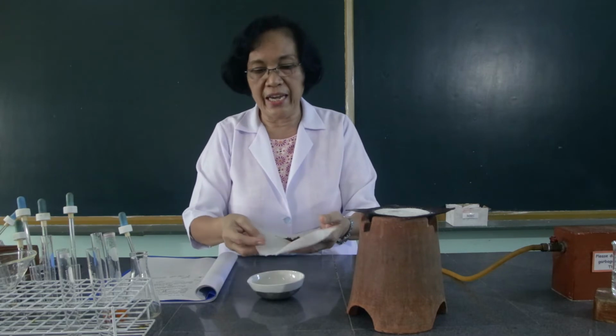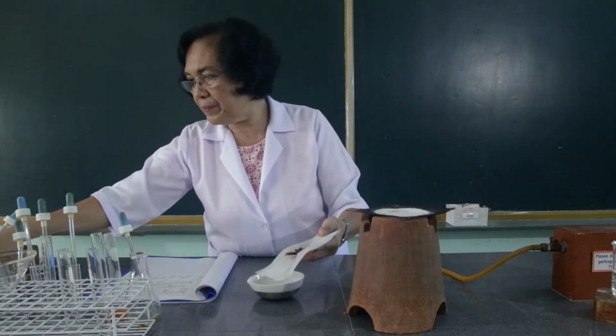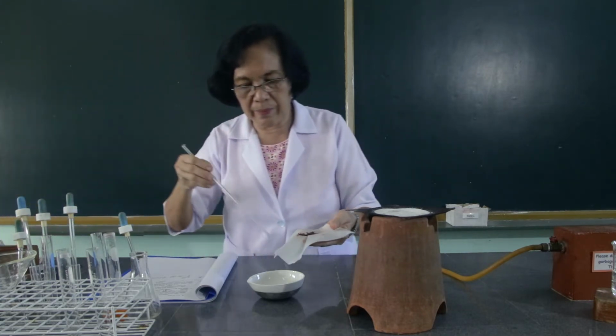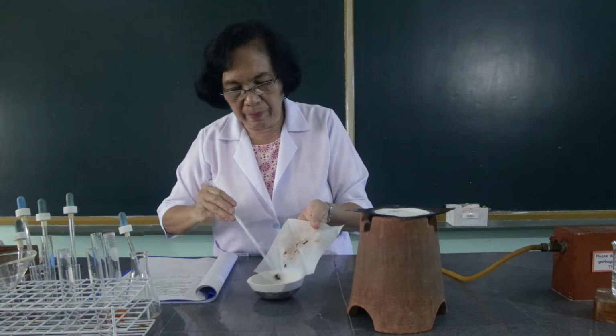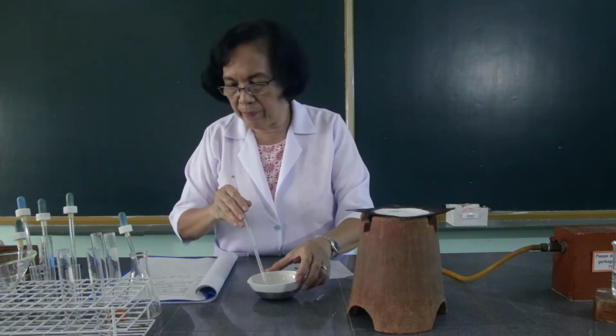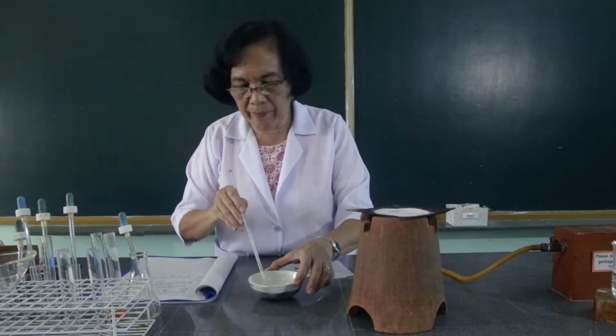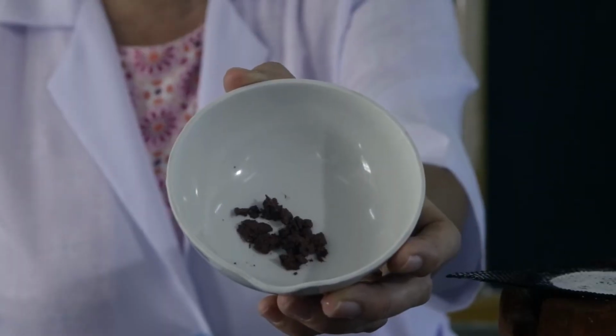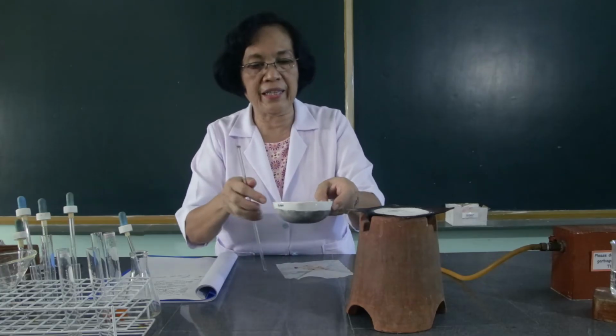The next test is the test for the presence of iron in the blood. We're going to use this residue which we set aside a while ago. We're going to transfer this into the evaporating dish and we're going to heat this until it gets burned.